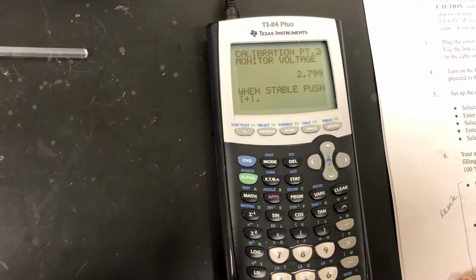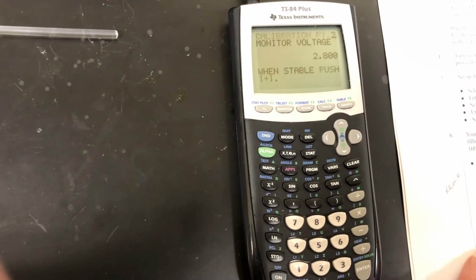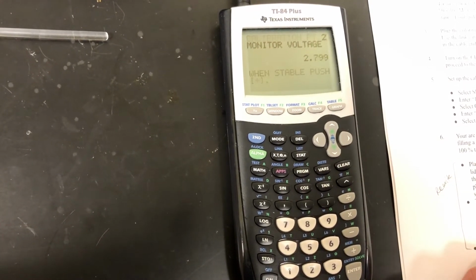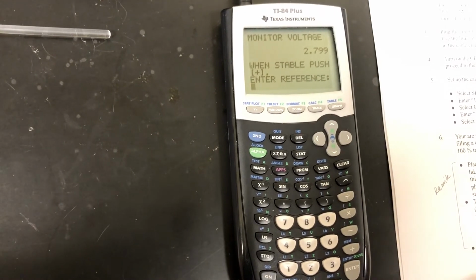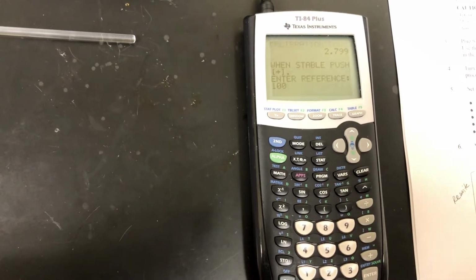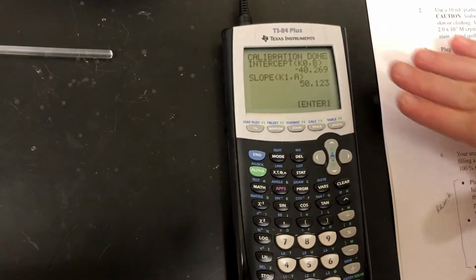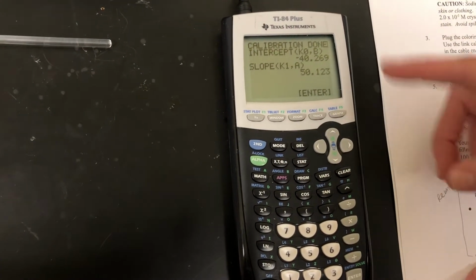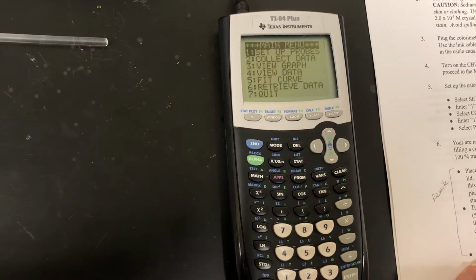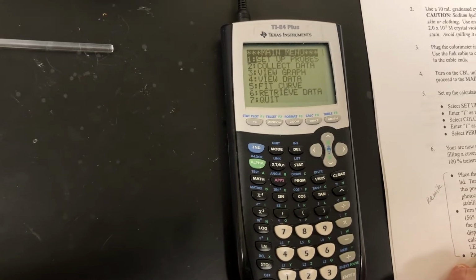Okay, so now that we've got it set at green, which is our second data point, and now that it's stabilized at roughly around 2.800, we hit plus, and then they want our reference for this. Well, this is 100% transmission, so we type in 100 and hit enter, and then now you can see that it essentially has both a 0% and 100% transmission value. And then now we can hit enter and our calibration is complete. Now it brings us back to the main menu, and now we are ready to set up our data collection.